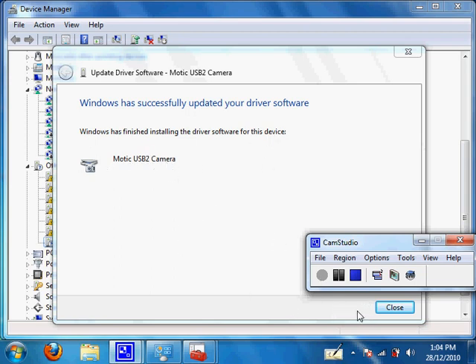What you need to do, it may ask you to restart the computer. It may not. Depends on the computer. Either way, if it does ask you to restart, restart. If it doesn't, just click Close.